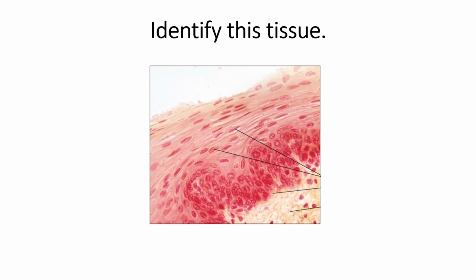No, right? Again, we said you might be kind of thinking, oh, maybe this is smooth muscle. But then we have this kind of beige area of tissue down here. And what was the point in them showing us that part, right? So it's to help us know that what we're looking at is not smooth muscle, so we can eliminate muscle tissue. We don't see striations or intercalated discs, so it's not cardiac muscle or skeletal muscle, so it's not muscle tissue. It's not muscle tissue, it's not nervous tissue.